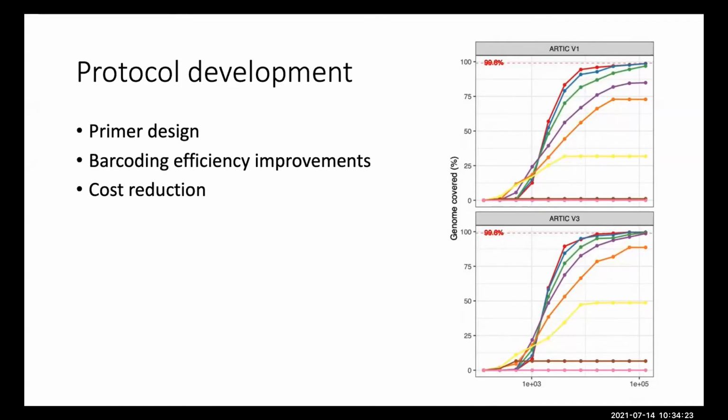You can see that there was a nice improvement from V1 to V3, where we were able to improve the number of titration points at which you can achieve maximum coverage. And we've done even better than this now, and I think we'll come back to that at the end.